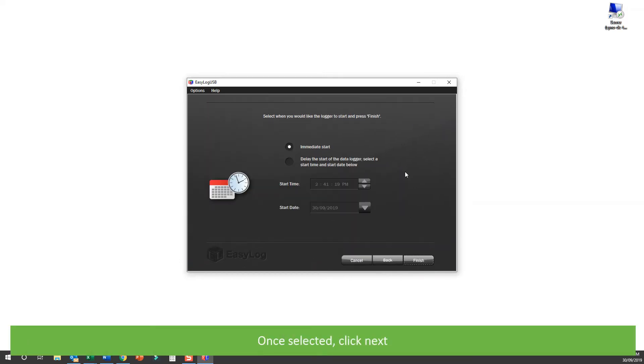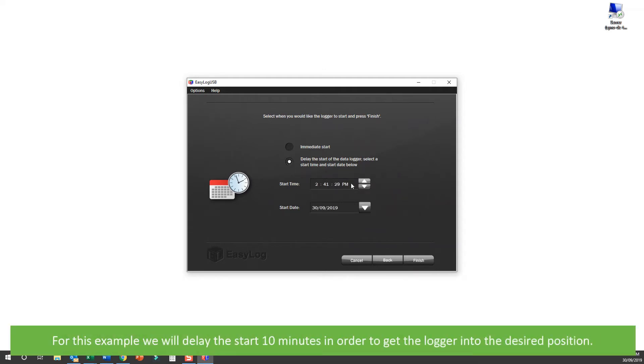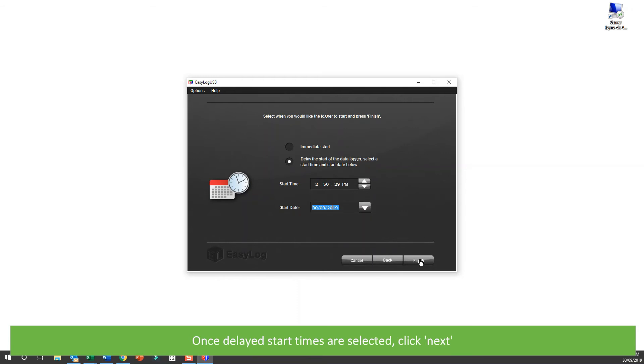Once selected, click Next. On the last step you can select to start your logger immediately or delay the start time and date. For this example, we will delay the start 10 minutes in order to get the logger into our desired position. Once you've selected a time, click Next.